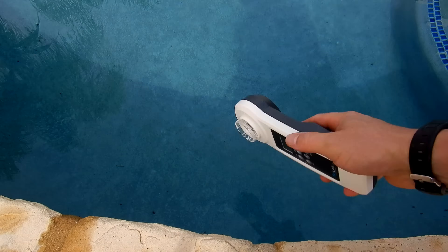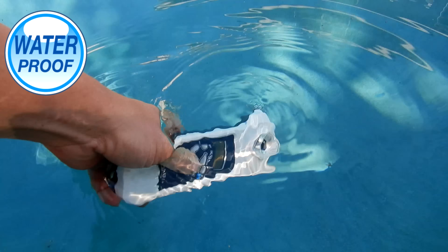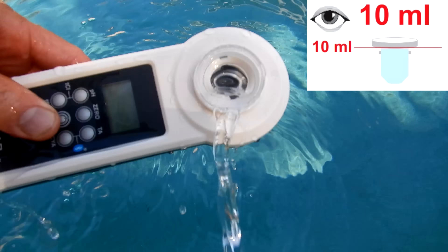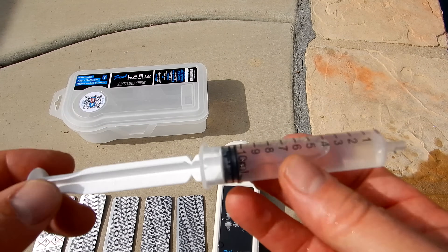First you want to make sure the unit is clean. Go ahead and dip it in the pool and rinse it. The PoolLab 1.0 is completely waterproof, so you can actually dip it in the pool to get the 10 milliliter sample of water. Just shake off any excess water until you're at the 10 milliliter mark. If you choose, you can use a syringe to get the 10 milliliter sample of water for your testing.